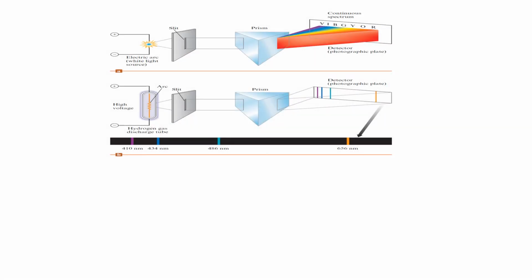Today we're going to look at stuff that we'll be doing in lab, and we're going to use something called a spectrophotometer. I'll show you in lab how that looks. Basically, it has a glass prism that's going to split up light. For instance, whenever it rains, you may occasionally see a rainbow. So what happens with a rainbow?